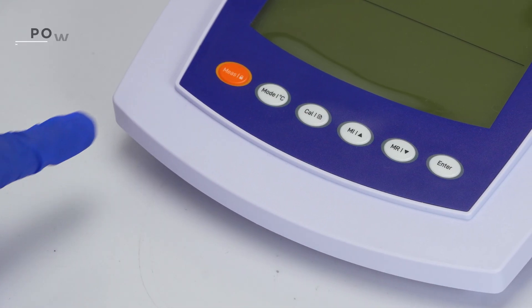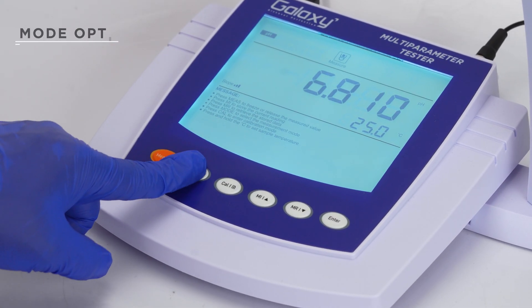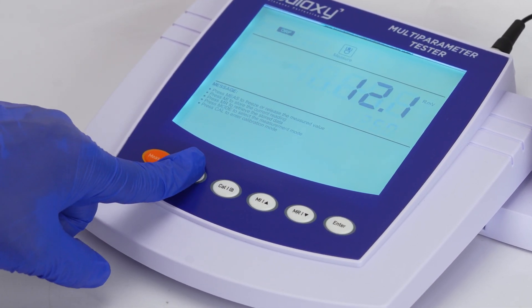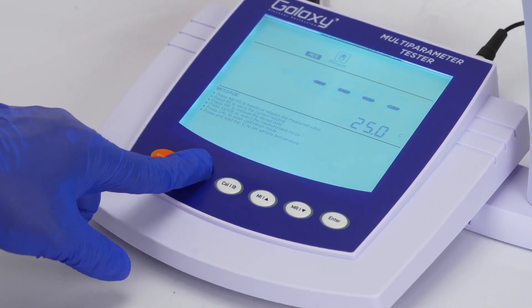To switch on the meter, simply press the measure key and release. Use the mode option to switch between ORP, conductivity, DDS, salinity, resistivity, and pH.